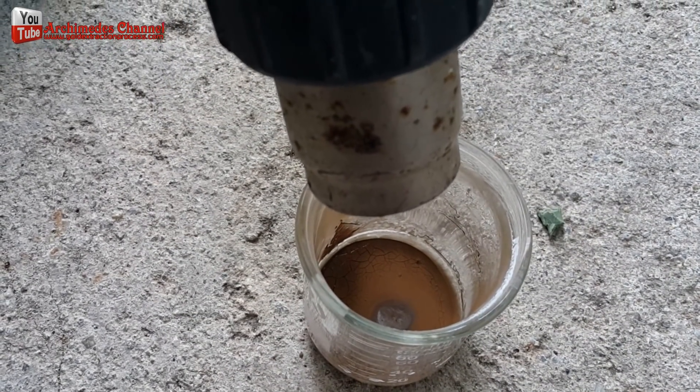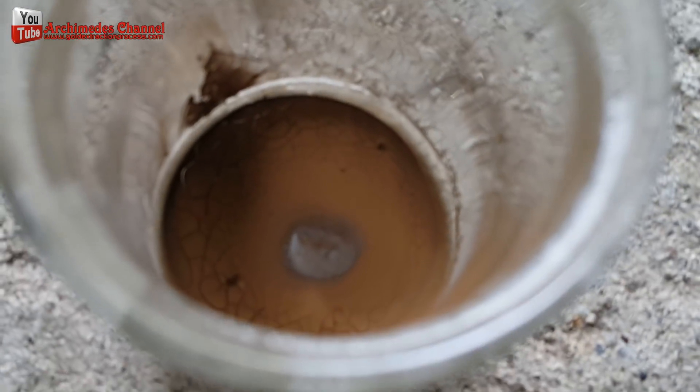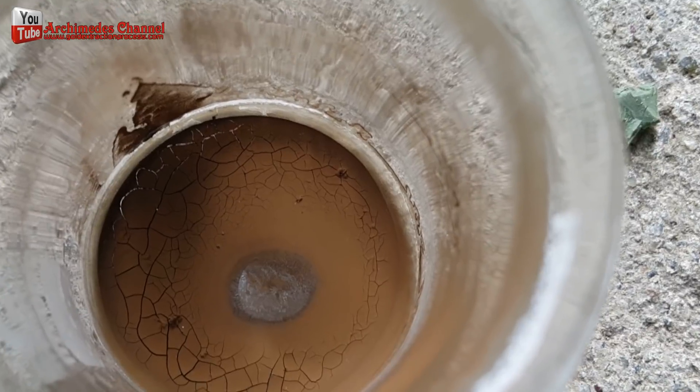Then I completely dried out the gold sediment by the careful use of a hot air blow gun, ensuring I did not overly disperse the fragments.